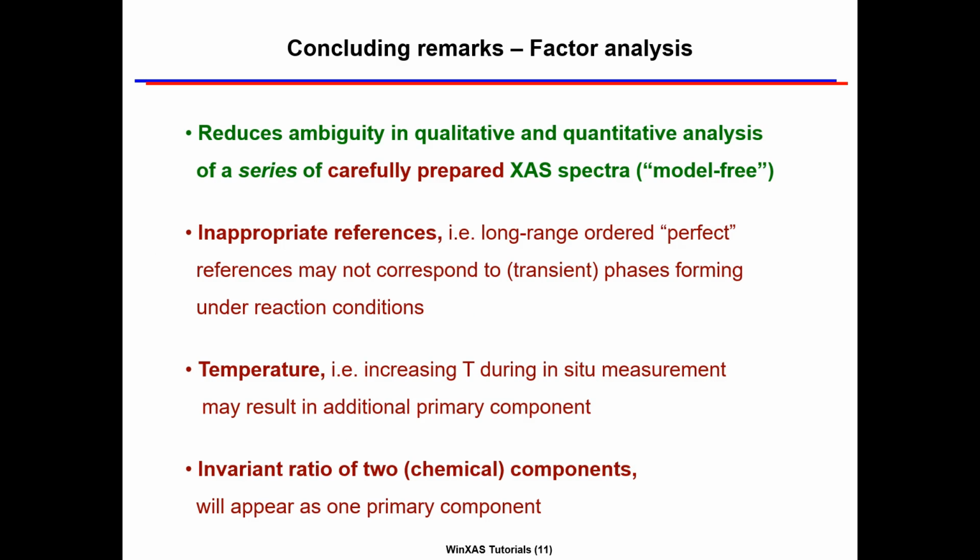Let's finish this introduction to factor analysis with some remarks or words of caution, if you wish. Factor analysis is a powerful tool for analyzing series of spectra, no doubt about that. However, careful preparation is key here. It refers to measuring both samples and references during the same beam time under identical conditions and, of course, later using exactly the same data reduction procedures for samples and references.